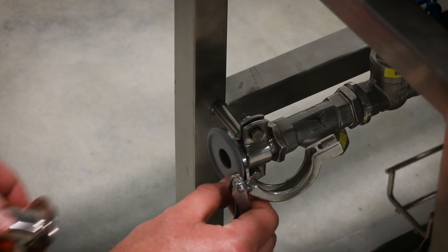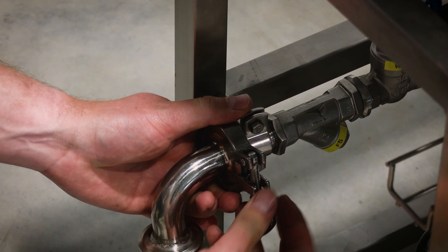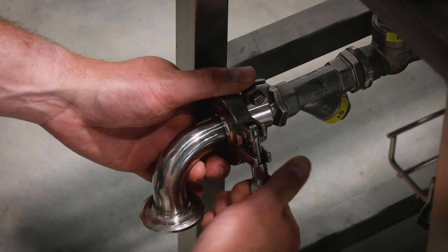Step 1. Using the appropriate hoses and tri-clamp connections, connect the cooling water input to the technological skid and ensure a secure and leak-free connection.